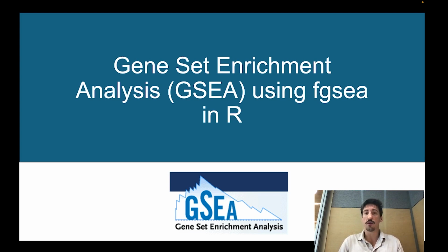Whether you're new to RNA sequencing or looking to enhance your analysis skills, you're in the right place. In today's video, we'll be covering Gene Set Enrichment Analysis. This is a powerful method to interpret RNA sequencing data and understand the biological significance behind gene expression changes. We'll break down what GSEA is, why it matters, and how it helps uncover meaningful pathways in your data.